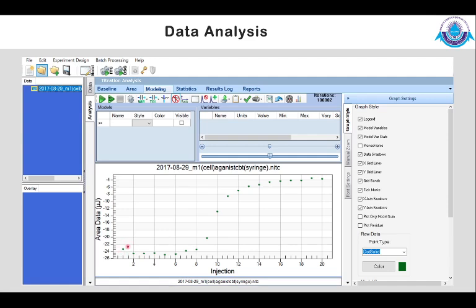And usually one thing that you have to observe here is that the first injection usually does not fall into place, because the first time, an equilibration does not occur properly. Sometimes the first point would not have the same trajectory. So if there is a first point or any point where there is an issue because of an air bubble or something, then you can carefully remove that point. It's standard to have the first point removed. Okay, so that would usually be out of position.